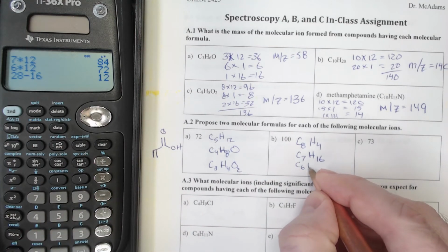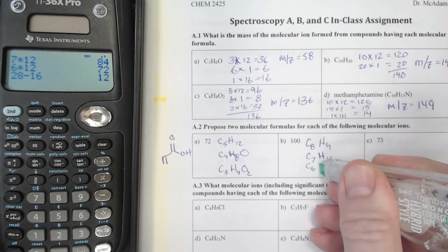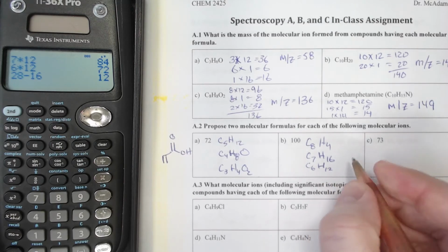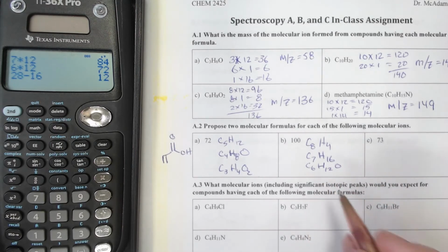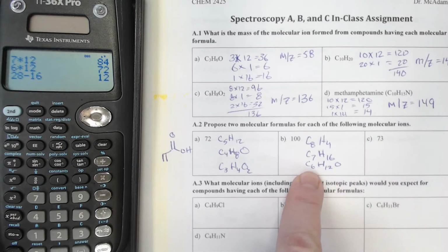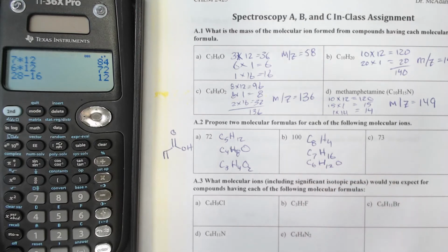So C6H12O, and that would definitely work. Again, that would be 72 plus 12 is 84, plus 16 would give us 100.